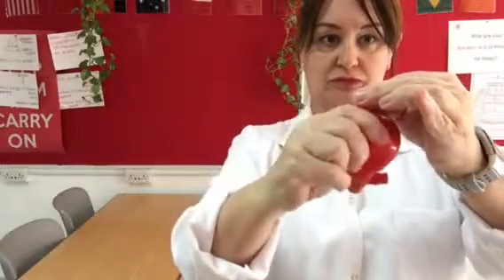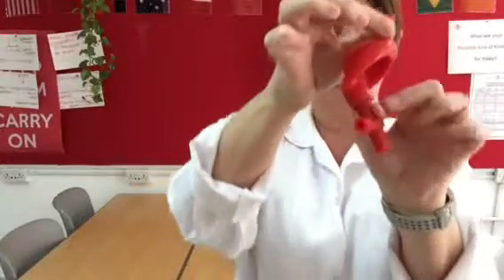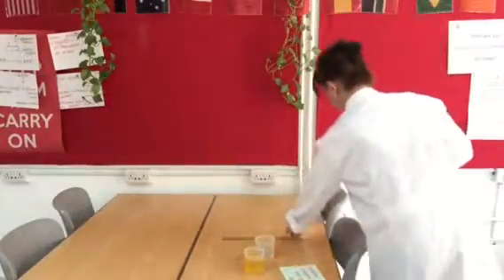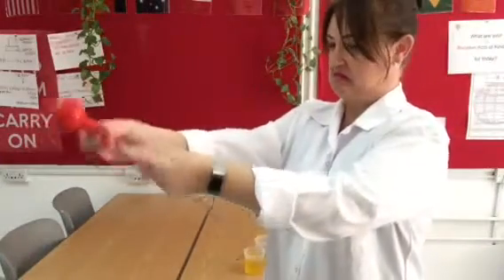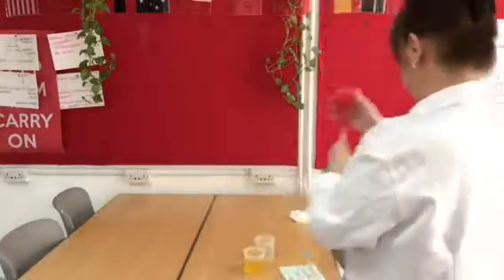To get the liquid into the pipette, I've got to use this ball pump. There's several valves on the pump, and if I squeeze the air out of it there and then I press this one, it will inflate and that will suck water up the pipette. We're really careful when we're putting the ball pump on the end of the pipette. We never push it towards us like this. You'll end up with a really terrible accident. We place it on there, make sure it's airtight.